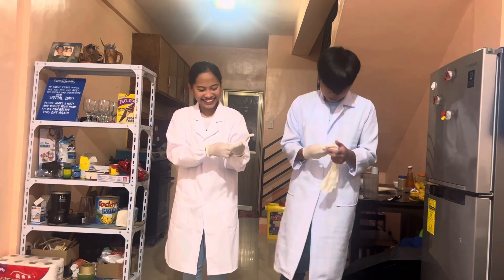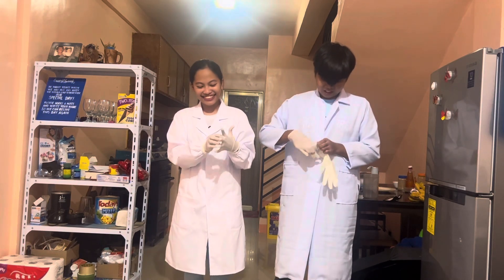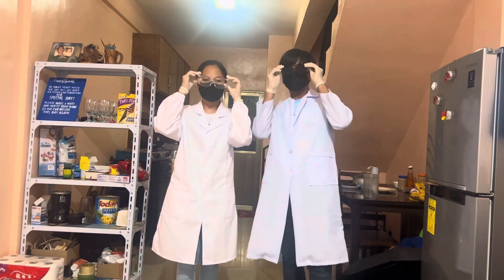But first, before we begin, we need to make sure that we are wearing our personal protective equipment — our hand gloves, our face masks, and our goggles.